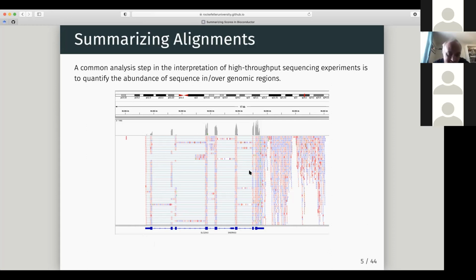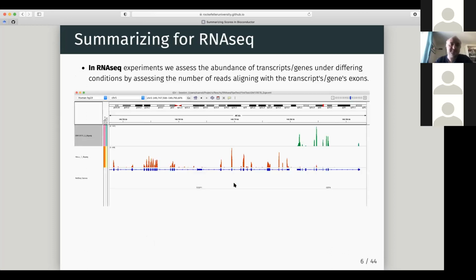These are our reads. We looked a little bit at this in IGV, but these look like a lot of reads, though they're not as much as compared to those which are falling over this. It's just gone over the end of the screen. But you can see we have splices, we have these lines, a read starts here, ends here. Do I assign it to that exon, this exon?